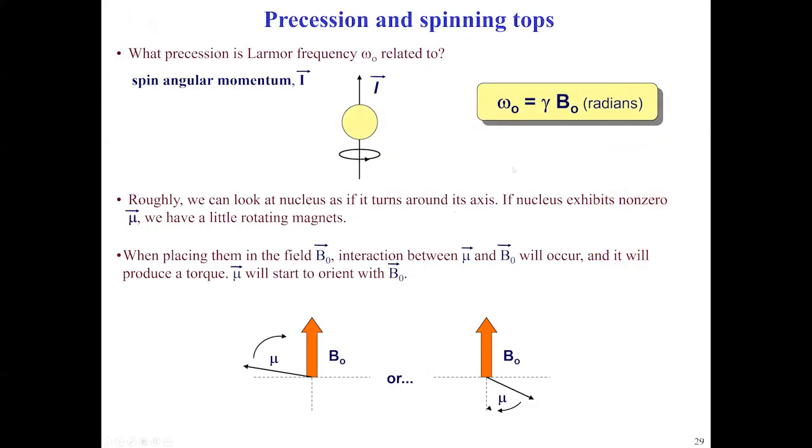So how do we envisage this? I showed you a very simple explanation earlier. So we consider our spin angular momentum. This is not really a spin. Spin is a quantum property, right? But these are simple models that help us to understand.